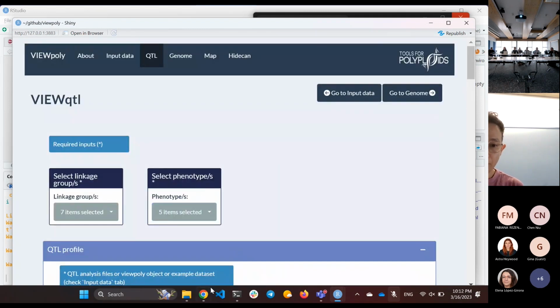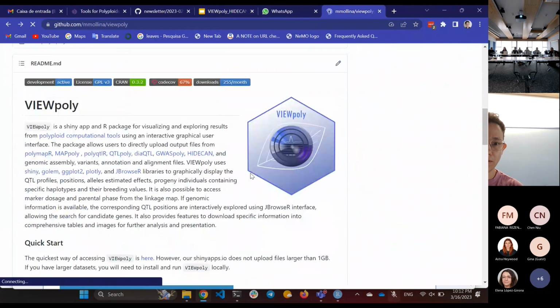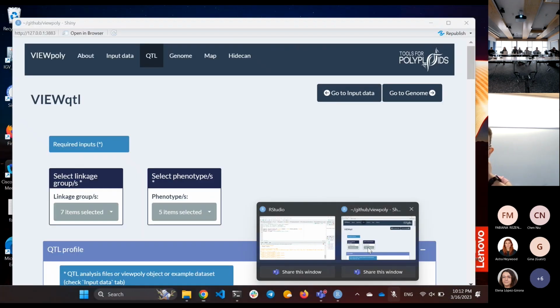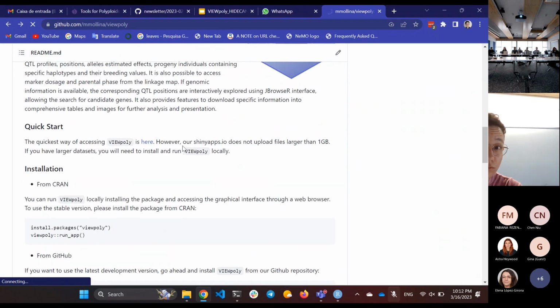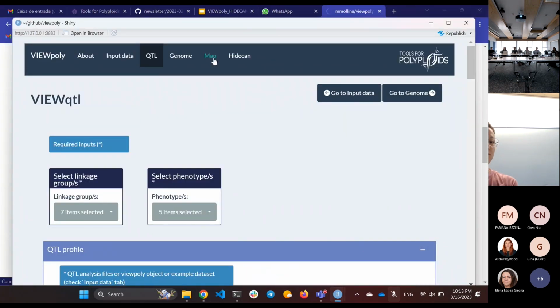And the genome, I didn't upload the genome, but I will show you here. The genome is a little bit heavy, so I will not upload it, but I can show you from the server version. Yeah, the Wi-Fi is taking a while, so I will jump to the other tab and then come back to the genome when it's done.